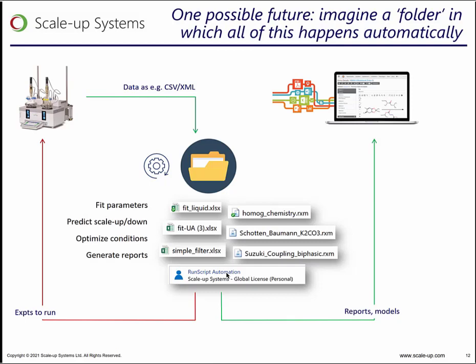It's certainly not going to be long before we can close the loop right back to the EasyMax or whatever lab equipment, Unchained Labs, whatever it happens to be that you're using to run that experiment. So now we've got quite a virtuous circle on the left-hand side of our chart. We've got data flowing from the lab to the model. We've got the model figuring out what the next experiments should be, sending those back for execution. It's just another level up from what we had before.